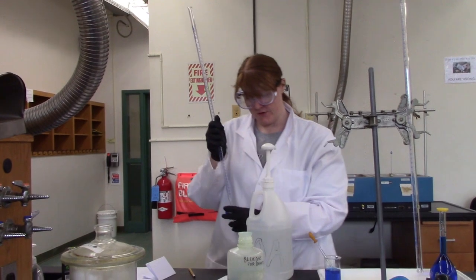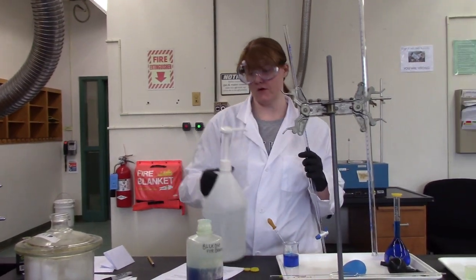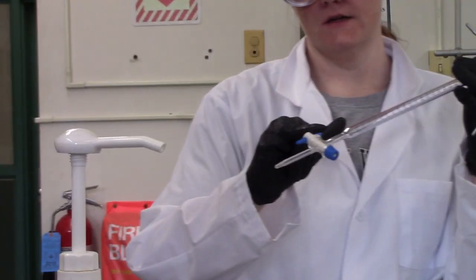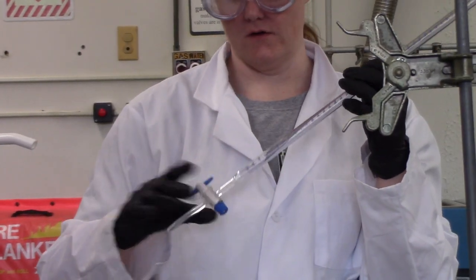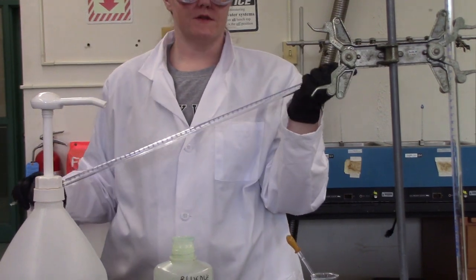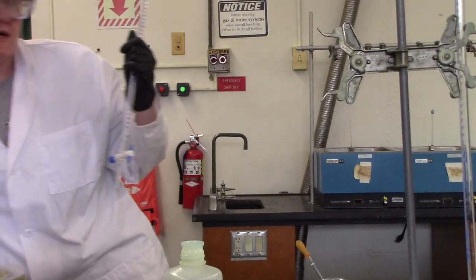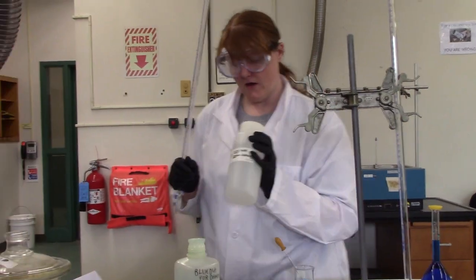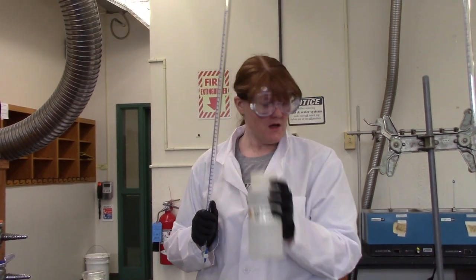The next thing you're going to do is rinse it with some distilled water. So you're going to use your squirt bottle to do that, making sure in all of your rinses that you do open the valve and allow the liquid to rinse the valve and the end of your buret. So you're going to do a couple rinses with distilled water to get the soap out. And then your final rinse is always going to be with the material that you're using. So today, we're going to be putting our base inside of our buret. So we're going to use this.